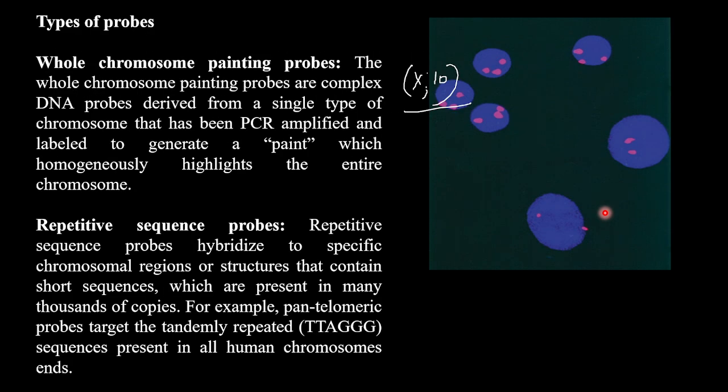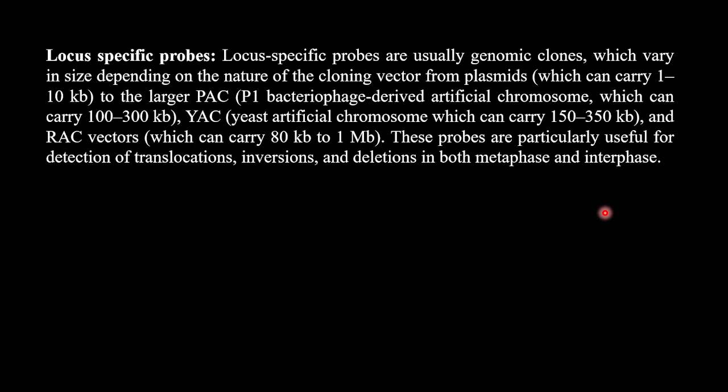Then, we are talking about how many kinds of probes we can use. Among these kinds of probes, the good probe which can give you very good information is the whole chromosome painting probe.